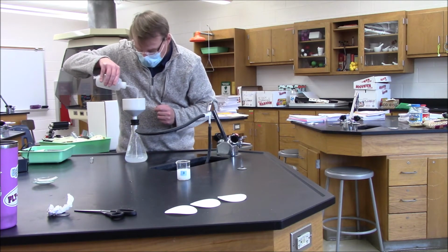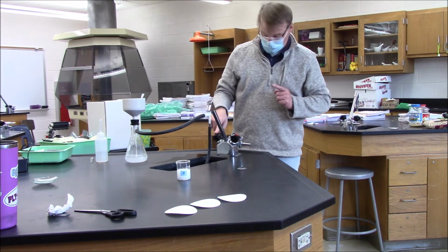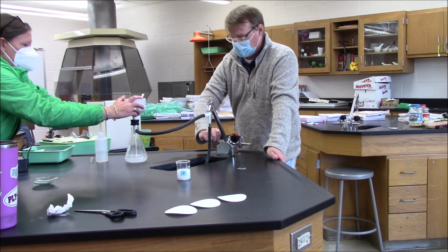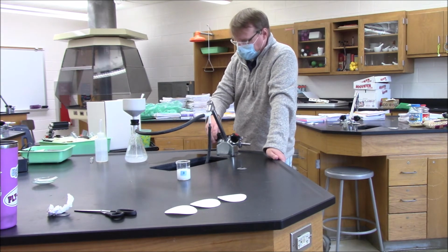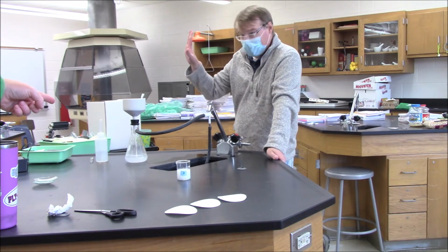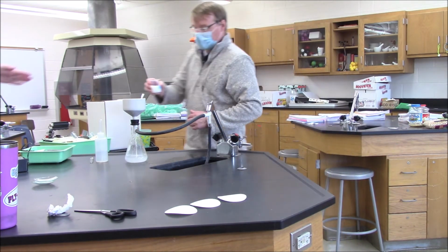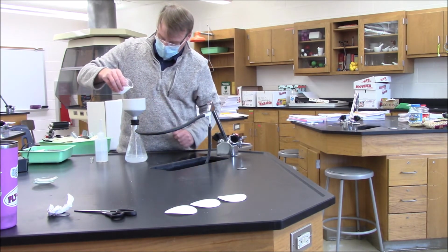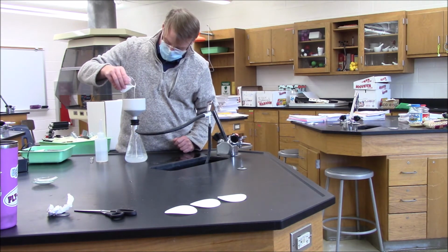All right. Okay, now you can go ahead and turn on the water knob, because that's going to start the filter. Turn it on all the way. You can see that there's water coming through. Awesome. So what that means is that we're ready to filter. Take the contents of beaker number 3, and carefully, slowly add it to the top of the filter paper. I can do it. You can do it.